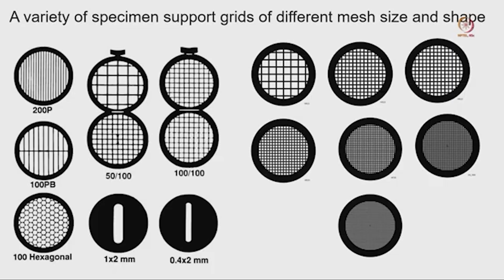So this is the grid we are talking about, and these are the metal bar areas. Most of the time you can get copper or nickel, and nowadays mostly you can see copper grids. Here you can see those are the metal bars. This area is completely empty, and this is the other metal bar coming like that and forming this square.